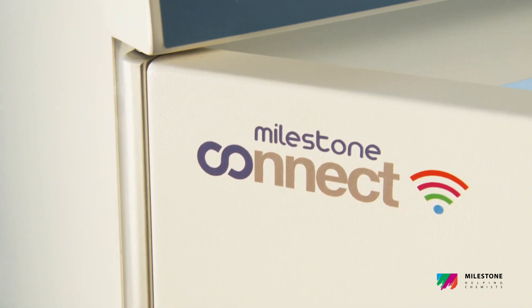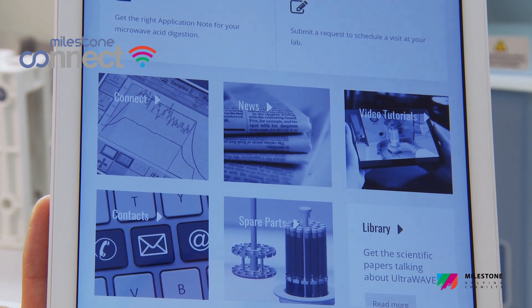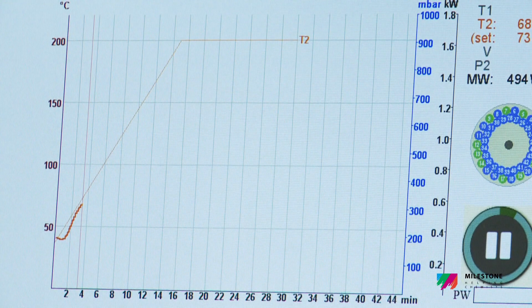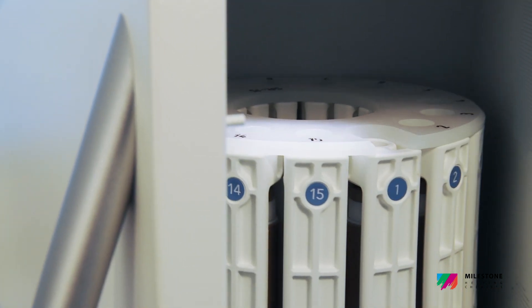Milestone Connect ensures both the access to a robust library of information 24-7 and remotely controls the system, resulting in a perfect complement to the Ethos Up.